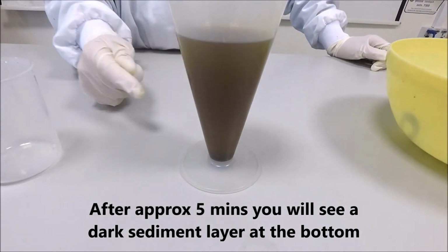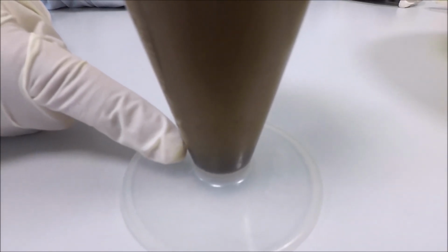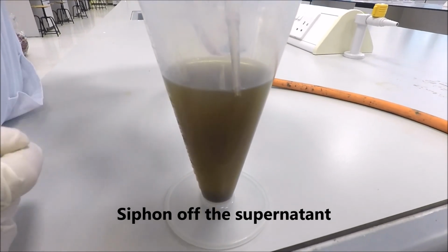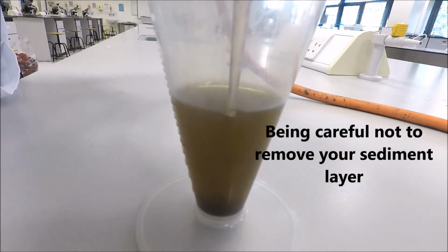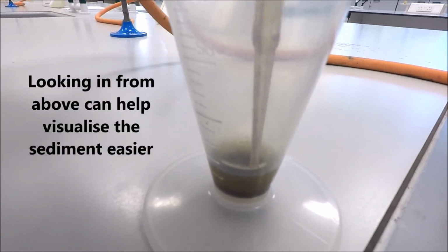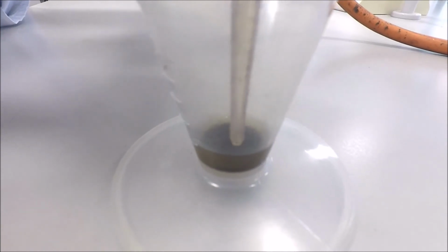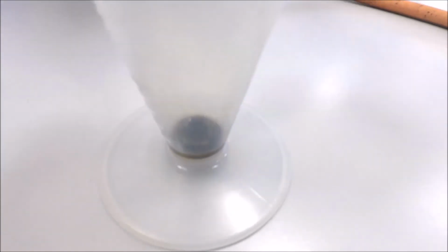After approximately 3 to 5 minutes, you will see a dark sediment layer at the bottom of your flask. Your fluke eggs will be in this sediment. Using the siphon attached to your tap, remove all unwanted supernatant, being very careful not to remove your sediment layer at the bottom. If you find it difficult, look in from the top. It can help visualize the sediment easier. Remove as much fluid as possible without removing your sediment.